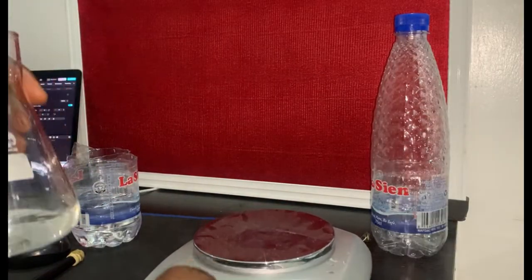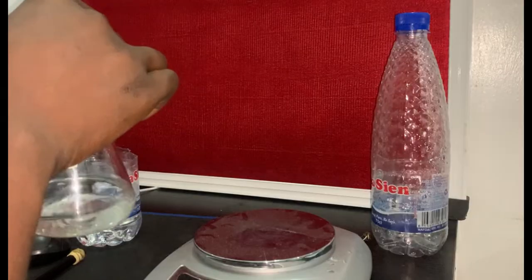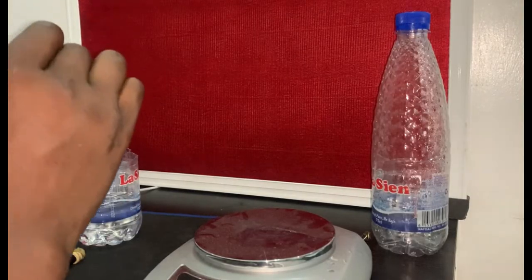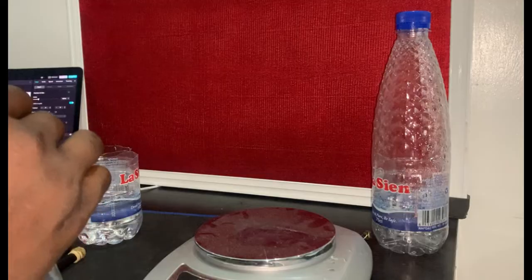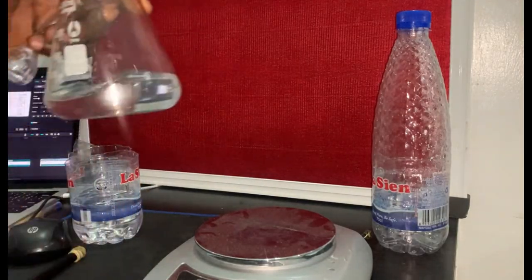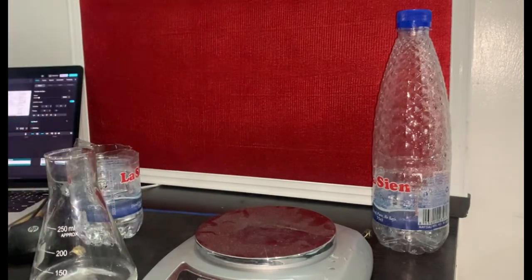Right? Because from the instruction they said use calibrated transfer pipettes and prepare a series of mixtures of the two liquids of varying composition. After thorough mixing and temperature measurement, use each mixture to fill the calibrated volumetric flask. Now, what I have here is actually 15 ml of A, which is water, and 5 ml of alcohol, which is B. I mix it thoroughly. Okay.